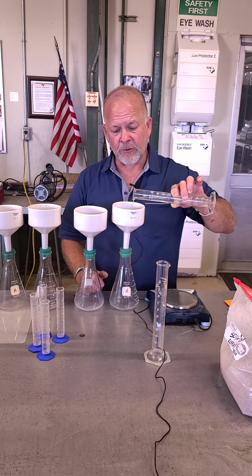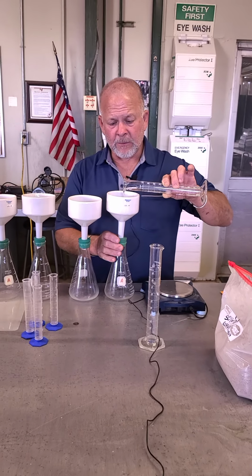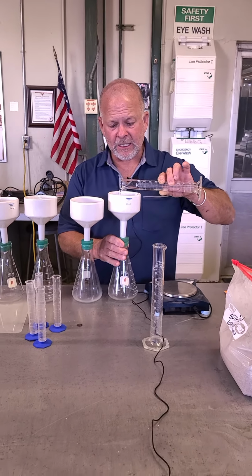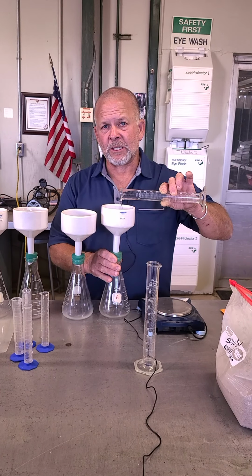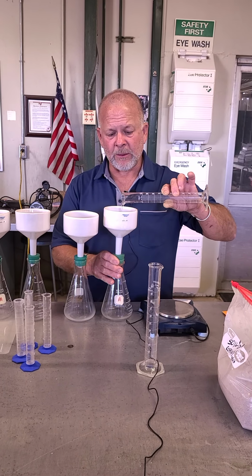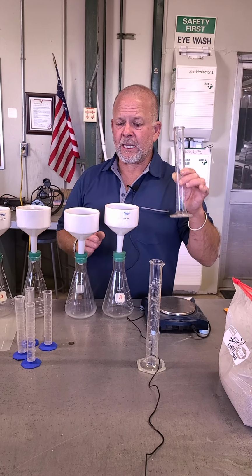So I'm going to carefully pour this water in around the soil. I'm not going to pour it in fast, because I want it to sink in. I don't want it to displace any of the soil material on top of the Buchner funnel any more than I have to. I'm just going to carefully put that in. So we're going to repeat that process.